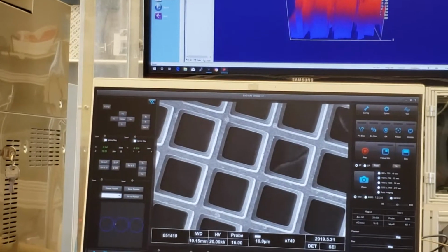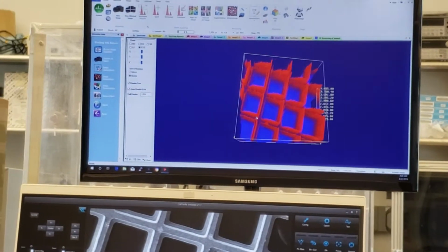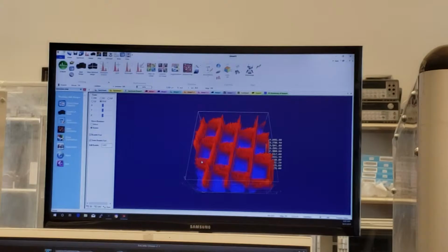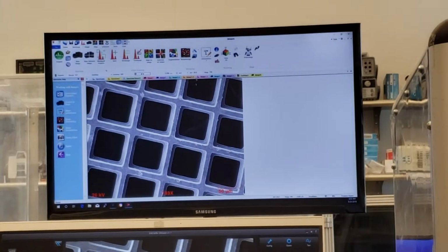Go zoom, render fast, rotate. Let's grab it and zoom it around. Great, so we can take a look at that, at the height. It's like a little height thing. That's under 3D rendering, so we can get rid of that too. Okay, back to where it was.